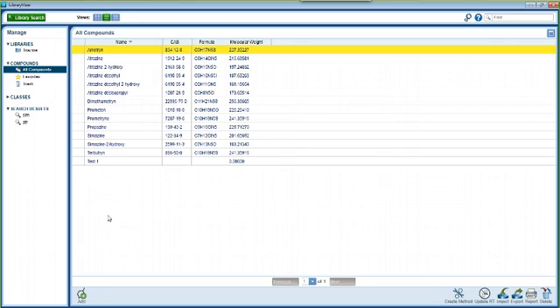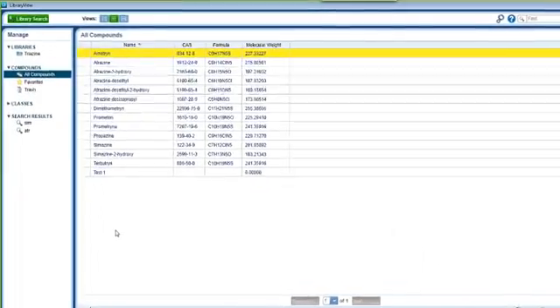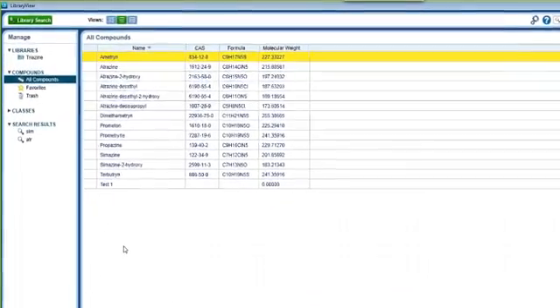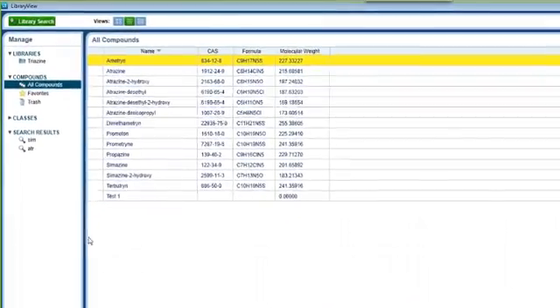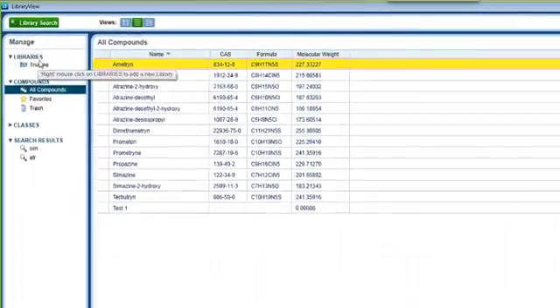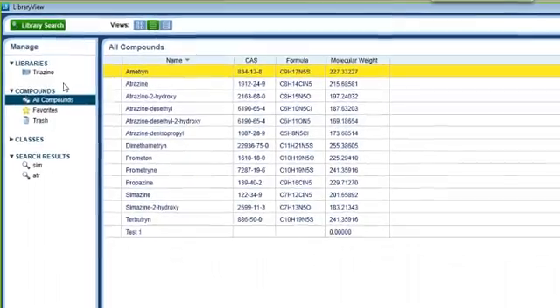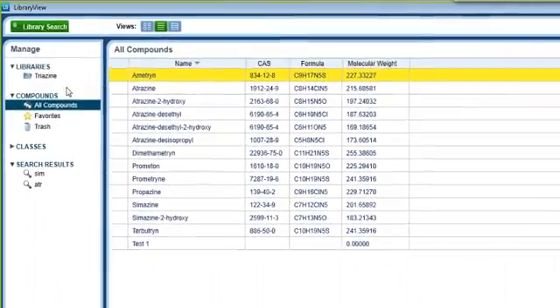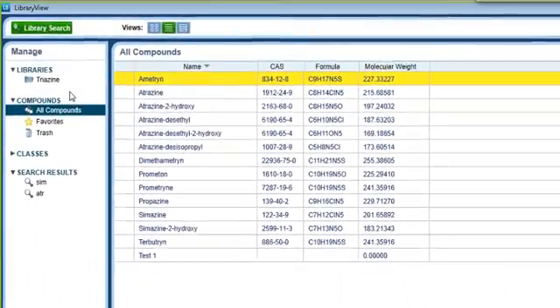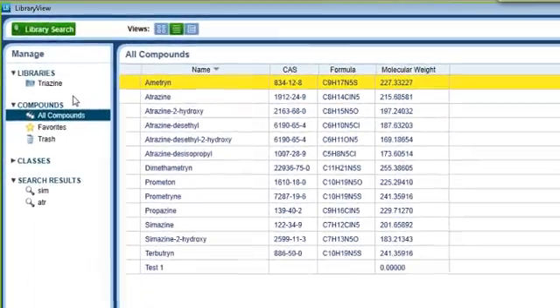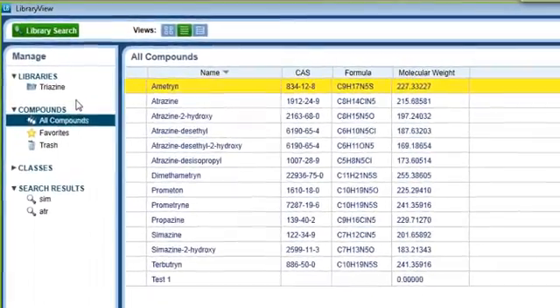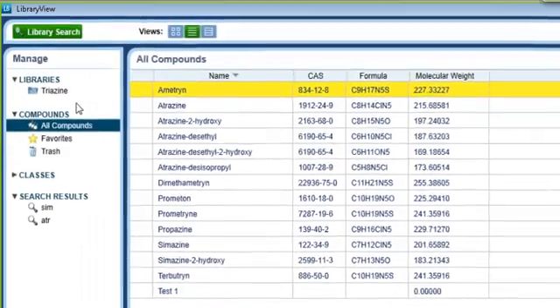Finally, I'm going to show you how to create new libraries of compounds already in your database. This is extremely useful if you do multiple assays on a system and only want to search a smaller subset of your total compound database.